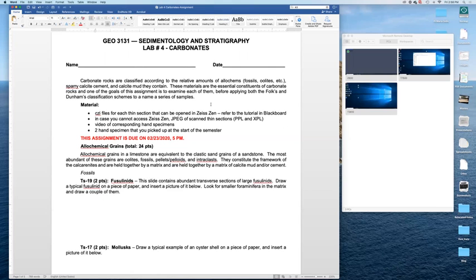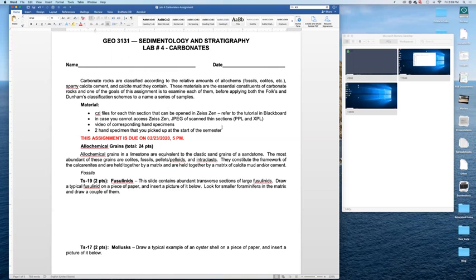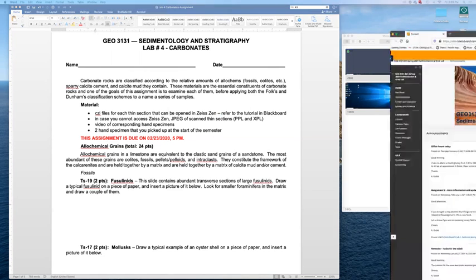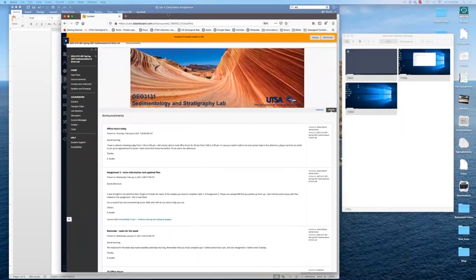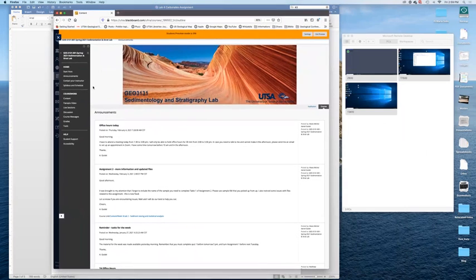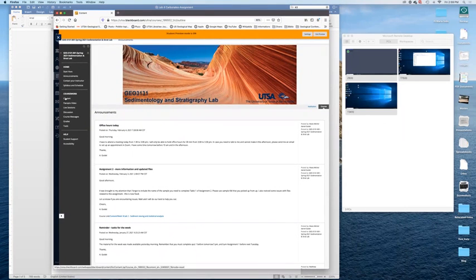If you are using either a Mac or a tablet, then you can use JPEG images of the thin section, either PPL or XPL. So let's start with the Zeiss Zen software.